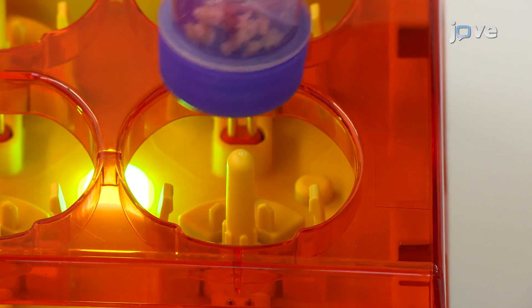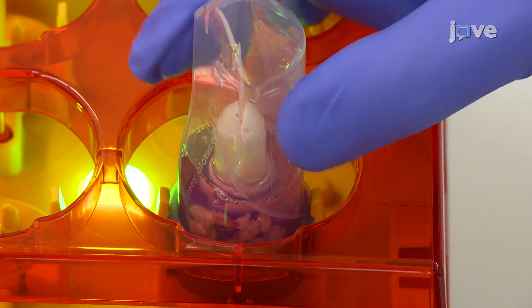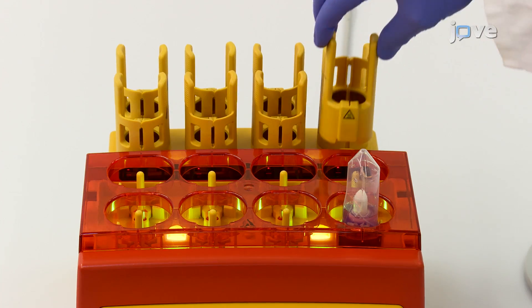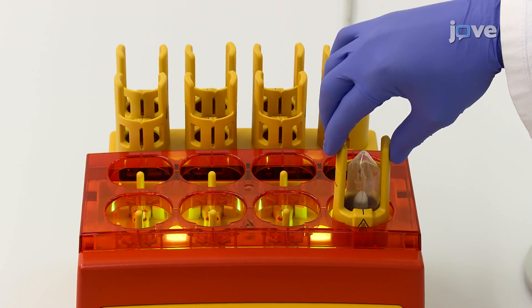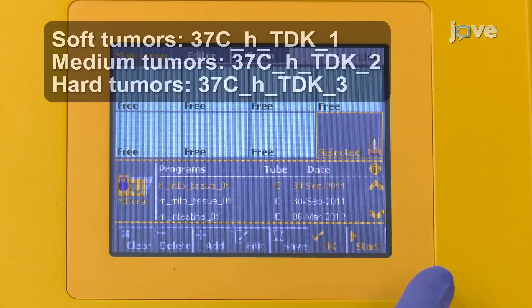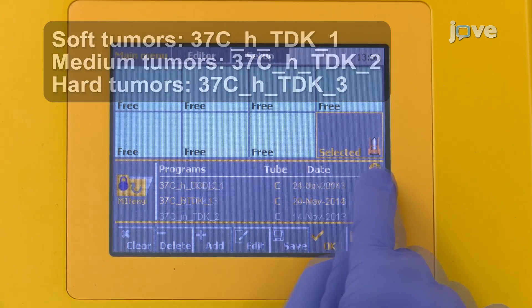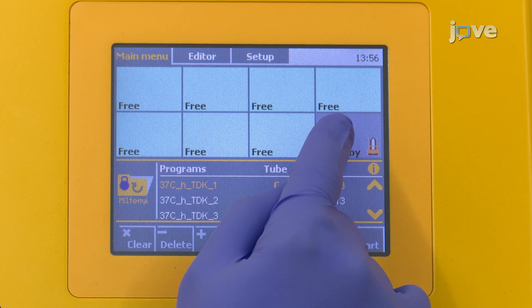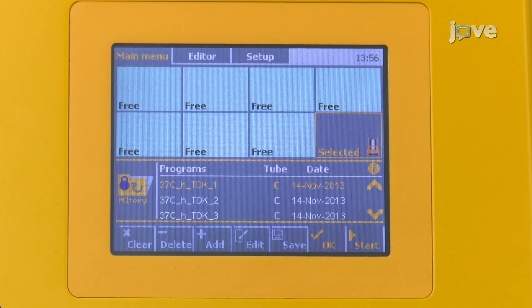Place the tube upside down onto a benchtop tissue dissociator mount and confirm that the tissue pieces are in the rotor stator area. Attach the heater to the dissociator. Then click the folder symbol on the touch screen and use the up and down arrows to select the appropriate tumor dissociation mode. Next, select the mount position where the sample is located and start the dissociation.